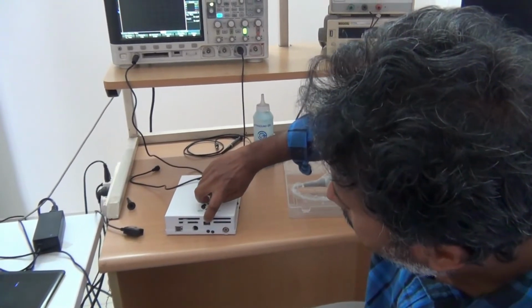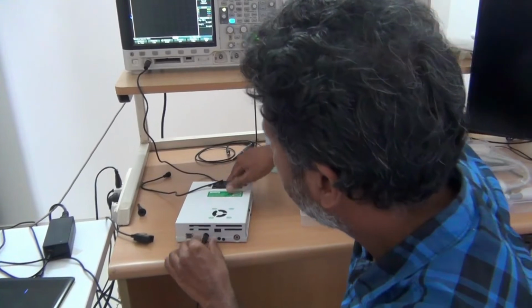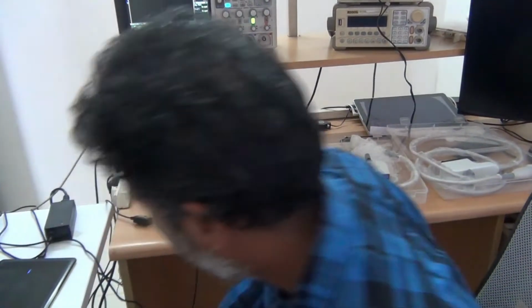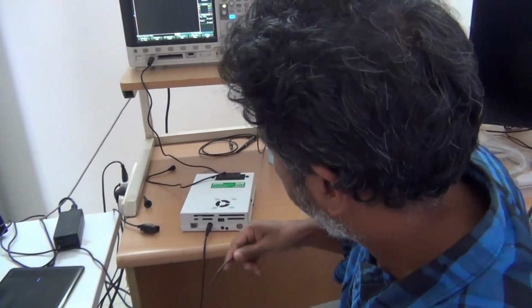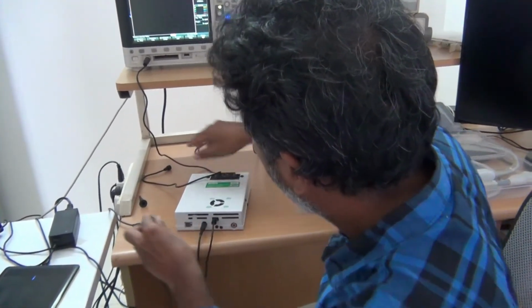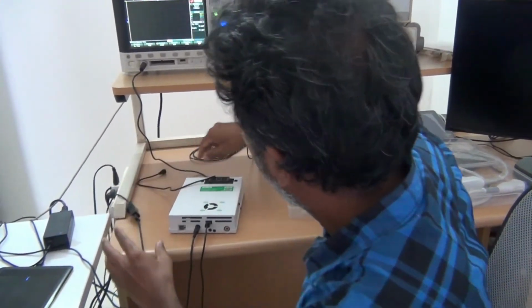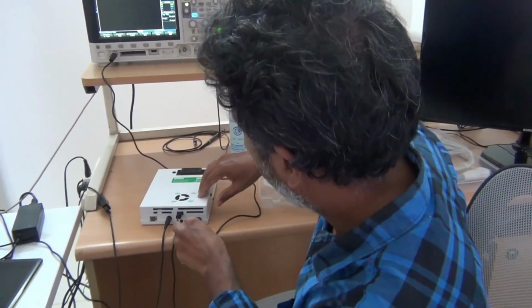This is the USB cable, and this is for the laser trig. So I connect the power supply. Then I connect the USB cable. Then I also connect the laser trig.